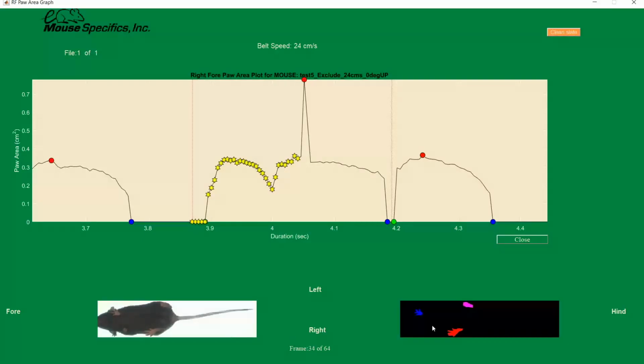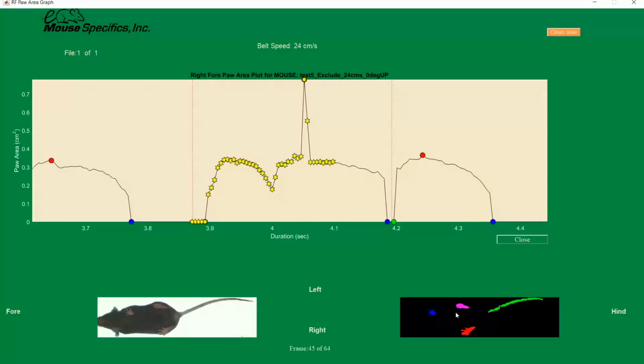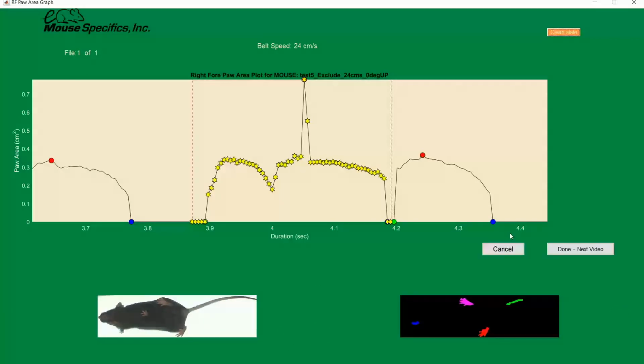Now look at the colored paw prints video in the bottom right. We can see that the paws are getting mixed up with one another, which is causing the noise. Because the stance and swing phase are being merged into one step, we are not going to be able to use the correct or connect to properly edit the noise. We'll have to use the exclude this time.